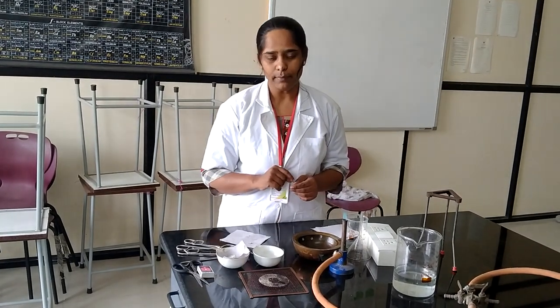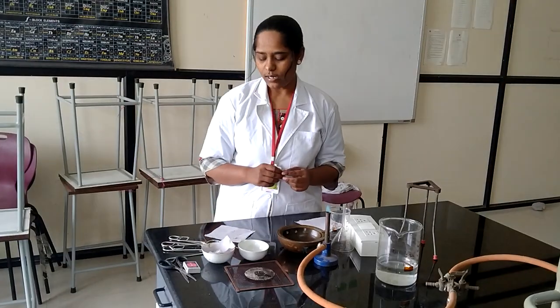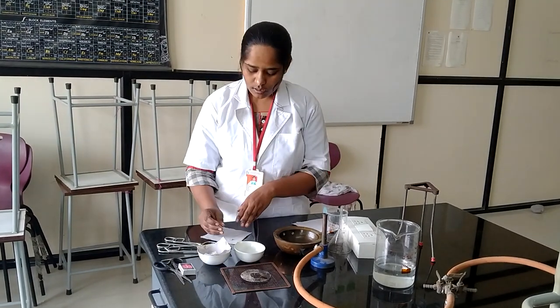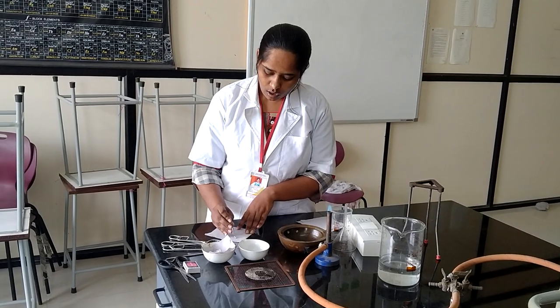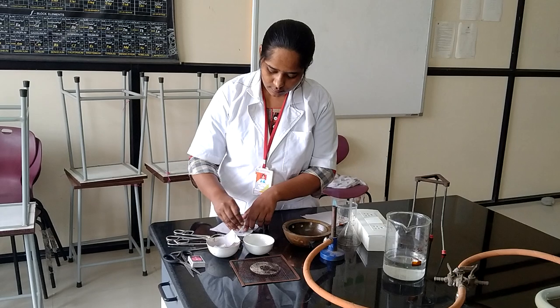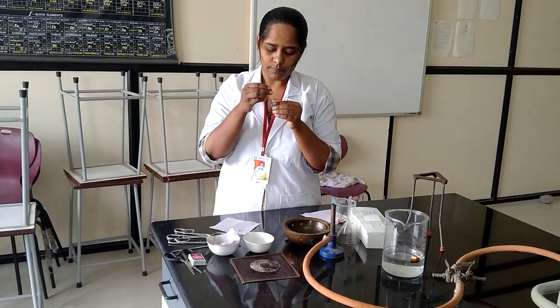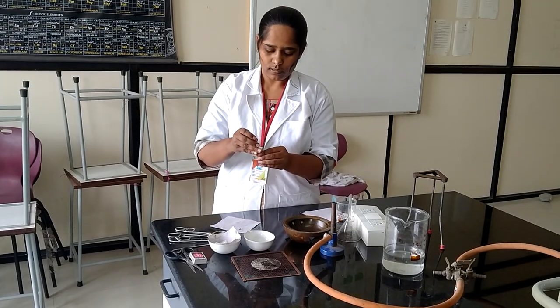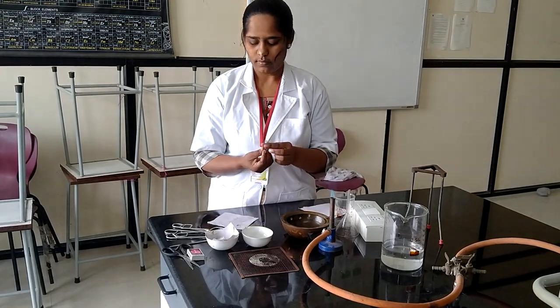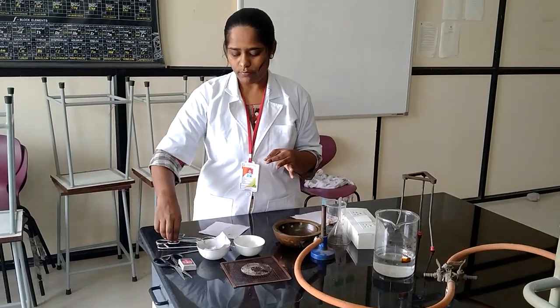Next we need sodium metal and an organic compound. First of all, take a fusion tube and fill it with a small piece of sodium metal like this. Take a small piece of sodium metal with the help of a holder.